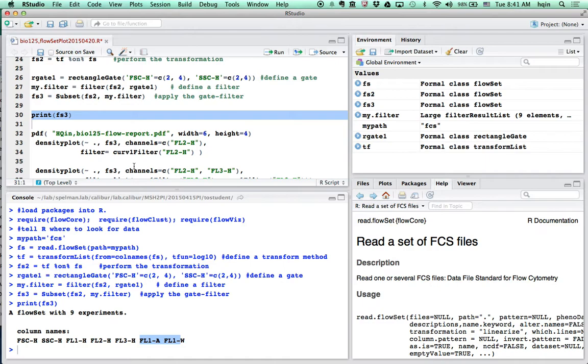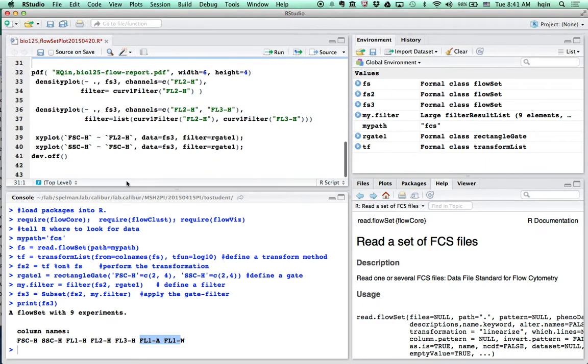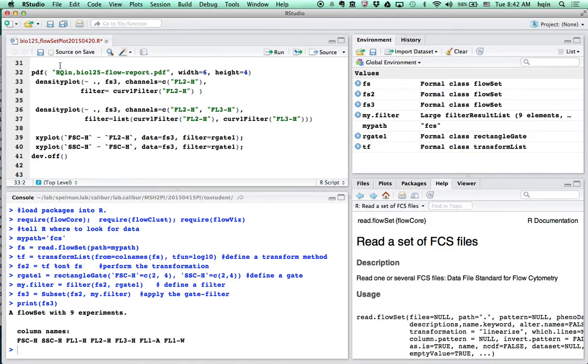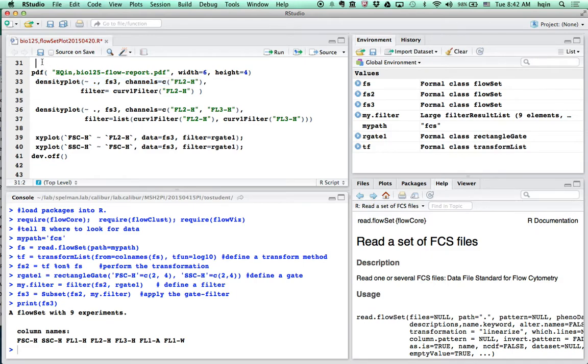So it turns out for propidium iodine, the color can be seen in both channel two and three. Channel one, we don't use that for propidium iodine.